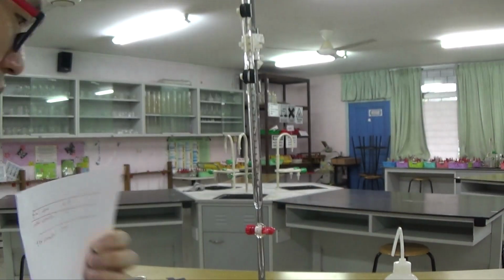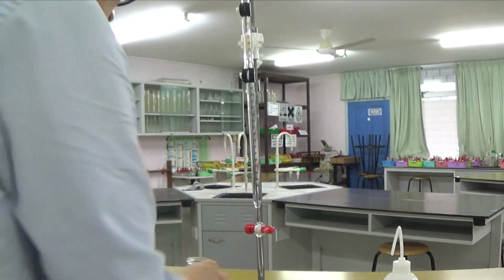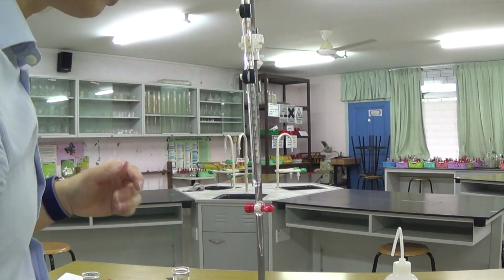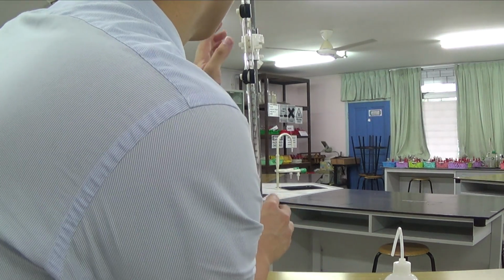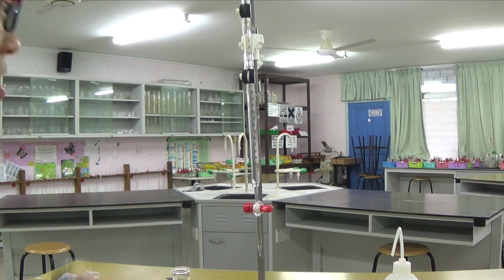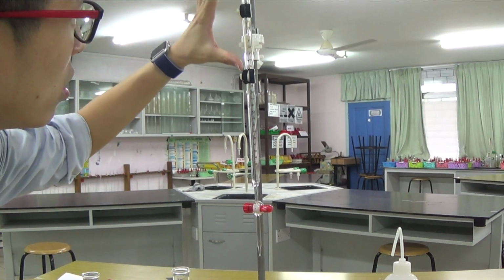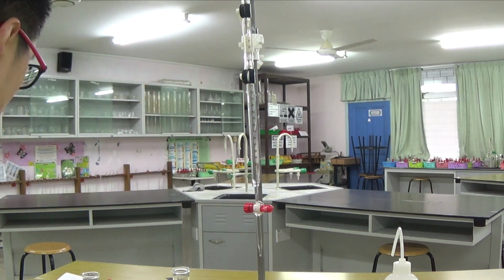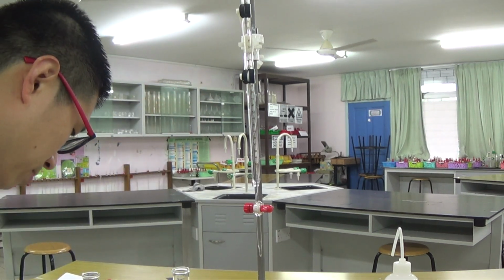So I think we're ready to get on with the second titration. I'm starting from the exact volume where I left off, 21.9. And we know that is acceptable because it was around 20-something. 20-something plus 21 is still going to be 40-something. I still have enough on my burette. So I can start from 21.9.